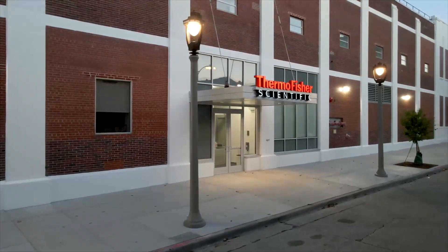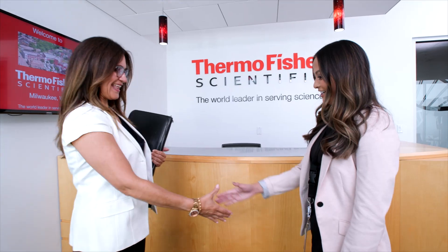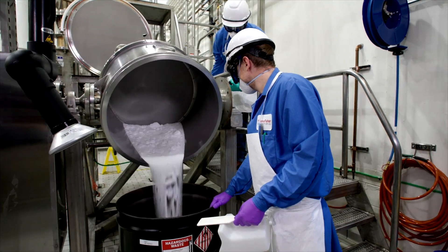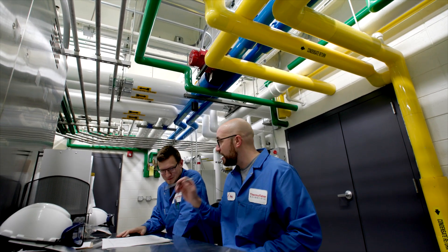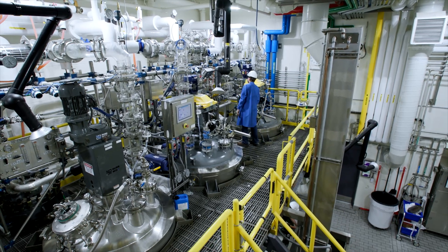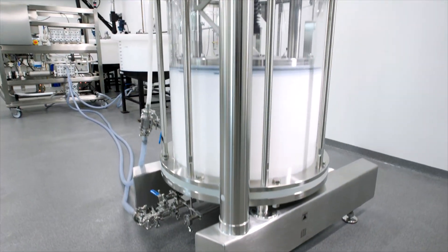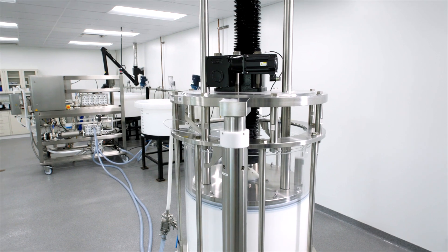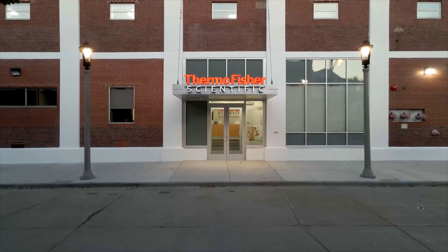The Thermo Fisher Scientific Facility at Milwaukee has a rich history of partnerships with developers of oligonucleotide therapeutics and diagnostics. Since 1982, we have customized and scaled up high-quality phosphoramidites and nucleotides for synthesis of oligonucleotides and nucleic acids.